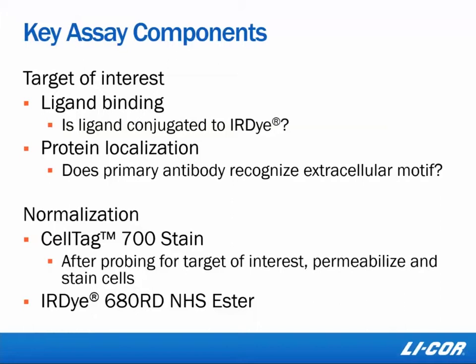This IRDye is a reactive IRDye and will non-specifically label the proteins on the cell surface in the In-Cell Western. And this will allow you to normalize from well to well based off of cell number. Now let's walk through some examples in research.